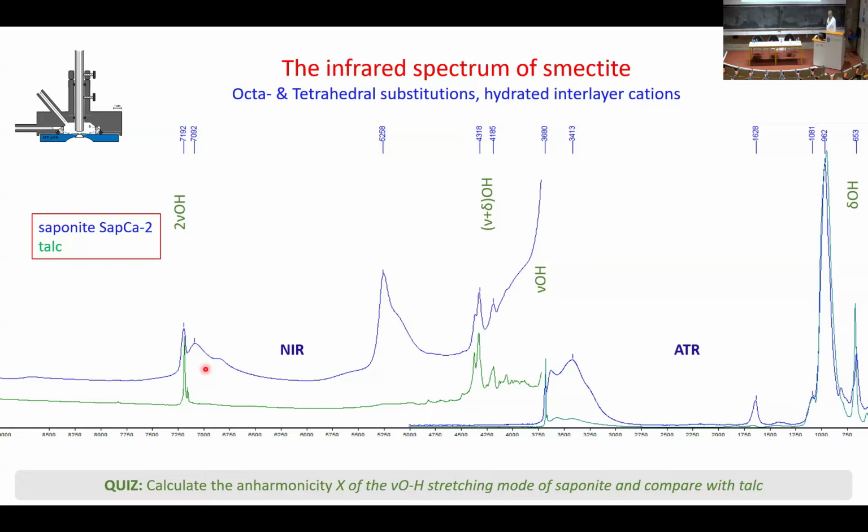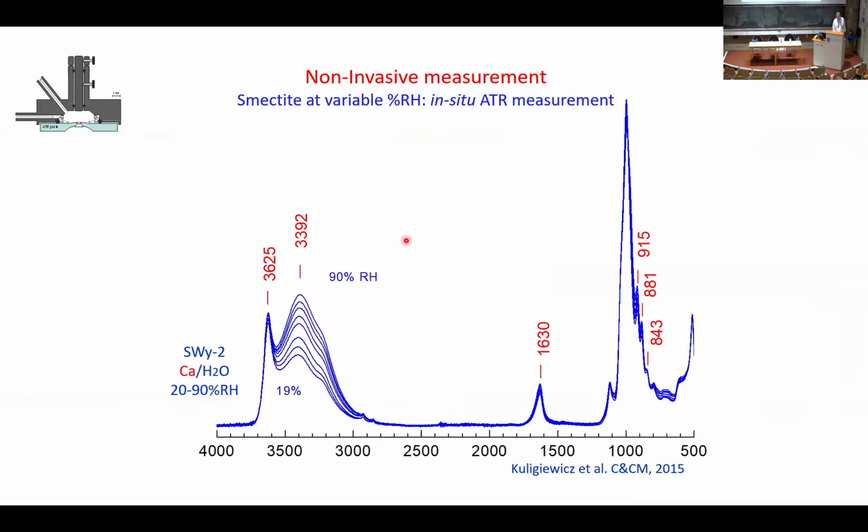On the previous slide that you are increasing the humidity, you show for the stretching, yeah, it's increasing the intensity, but in the bending. There is also in the bending, you don't see it very much in this sample, but there is also in the bending, if that's your question. Yeah, but my question is more like the stretching is more sensitive than the bending.